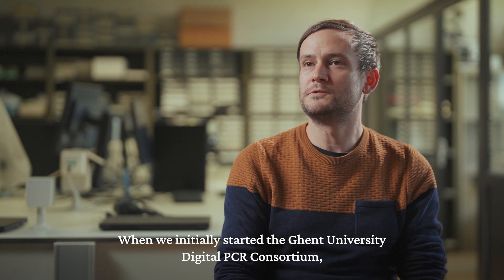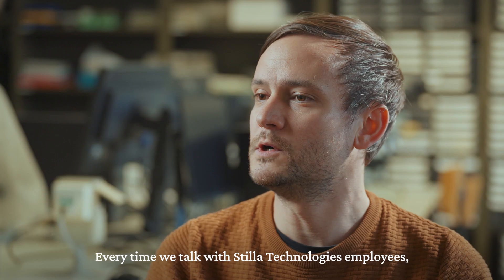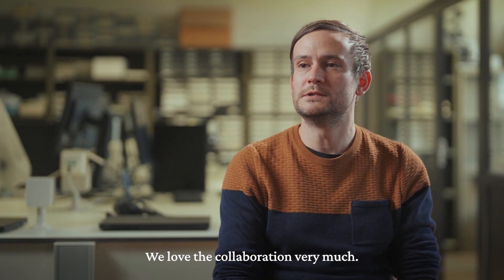When we initially started the Ghent University Consortium, Stila Technologies was one of the first partners we had from industry, and every time we talked with Stila employees we're always amazed about the high level of knowledge on digital PCR, and we love the collaboration very much.